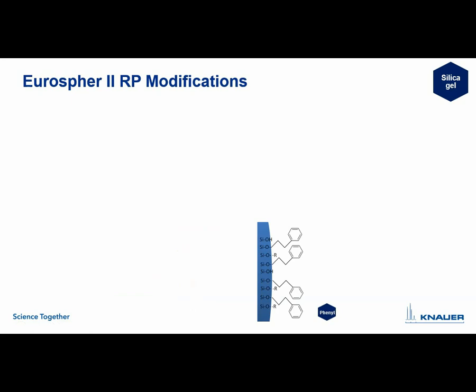And this phenyl phase can, of course, be used with something that also has a lot of aromatic systems. So, for example, these two molecules we could analyze very well on this column, because you see again, they are not so different from each other, but they had to be separated. Here we use the pi-pi interactions on these ring systems, and we got a little better separation than on any other column, so we used it.